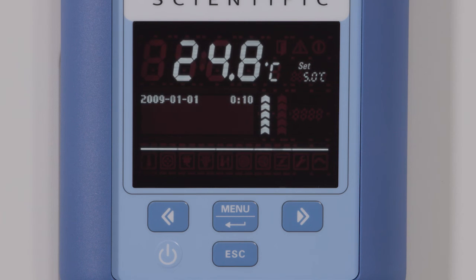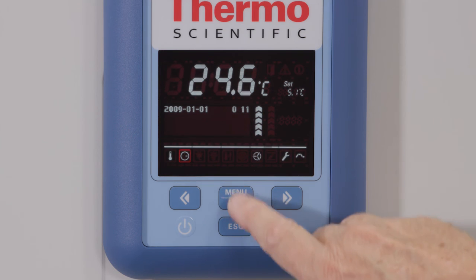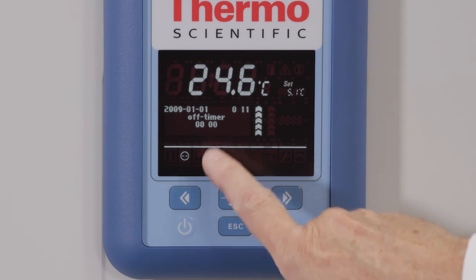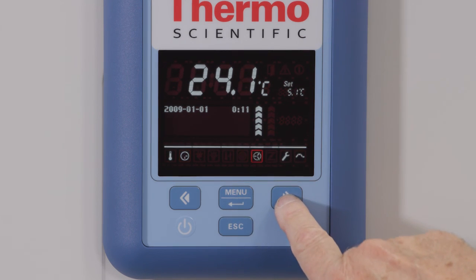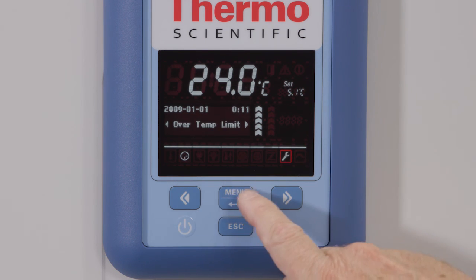The Heratherm refrigerated incubator also has a setting for a countdown timer, a fixed on/off timer, and a weekly timer, as well as the ability to program the unit to run through a defined cycle. To create a program, follow the detailed instructions in the user manual.